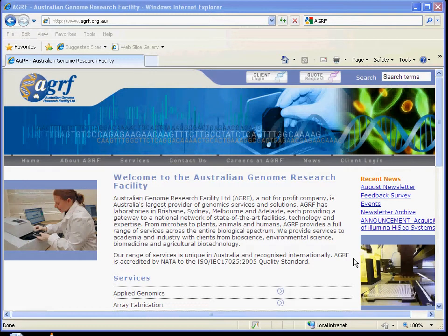Hi, my name is Ken McGrath from AGRF, and in this clip I'm going to show you how to log in to the website and submit some sample details in preparation for sequencing.